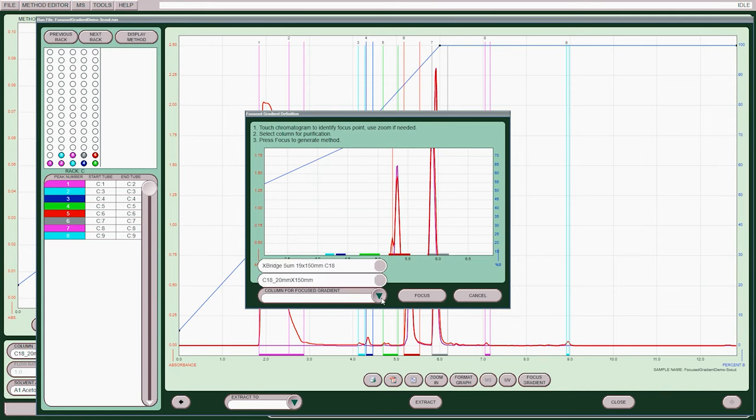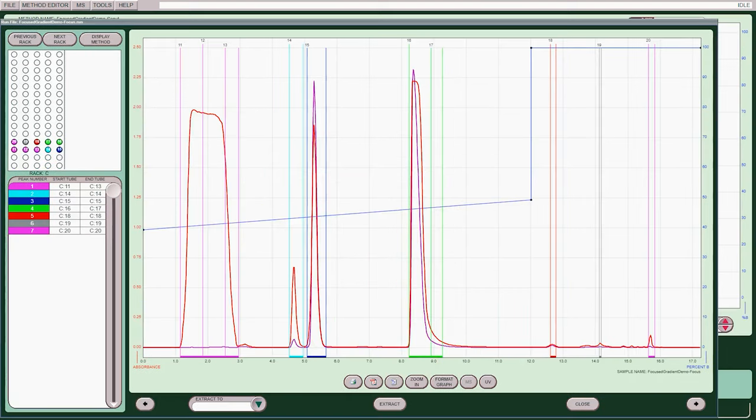Once the peak is selected, choose a matching column for purification and press the Focus button on that second screen. The Acuprep automatically generates a focus gradient centered on the selected peak.